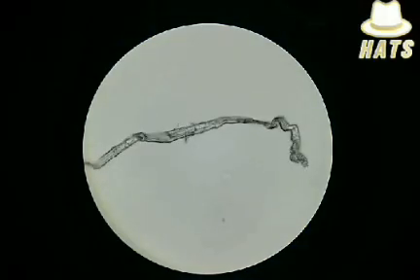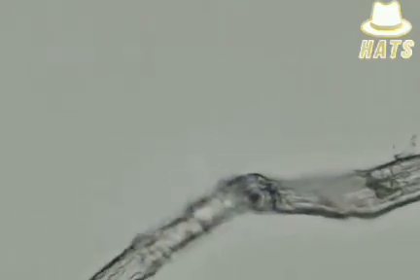This is graphene oxide. I will enlarge digitally, almost four times plus, so it has to be 1600 times. This is graphene oxide nanotubes or something similar. So yes, Dollarama is putting in the gel—they're dispensing this gel that has graphene oxide.